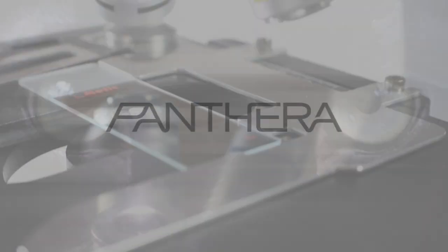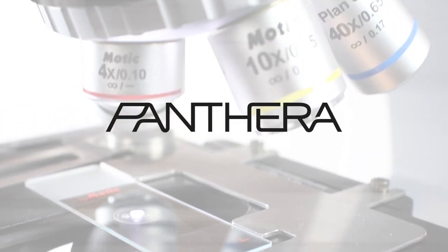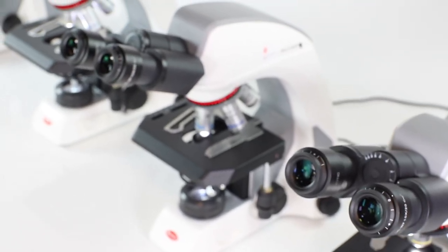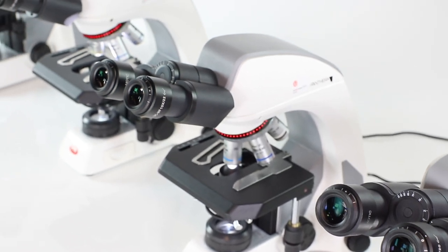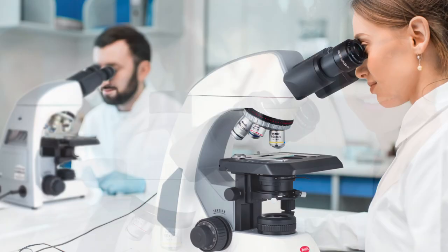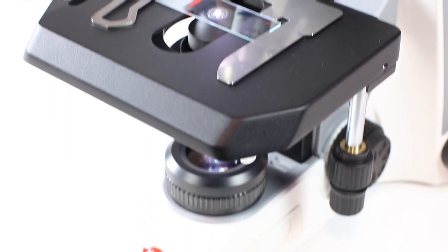The new era of light microscopes starts now with Panthera Generation 2, Panthera E2 and C2. This next generation evolved for you, always having your multiple demands from education and laboratory in mind. Precise engineering combined with high quality materials.